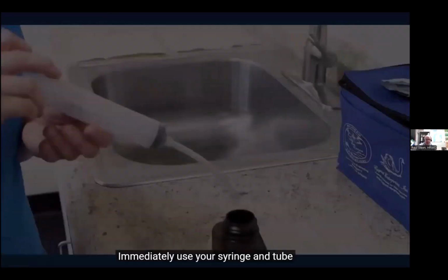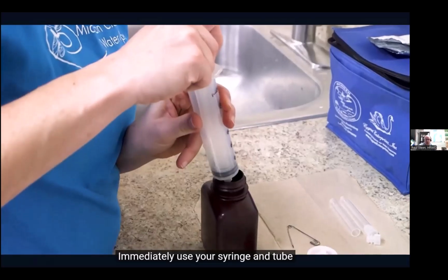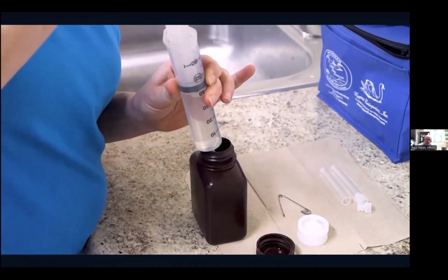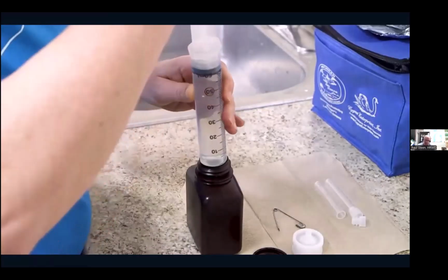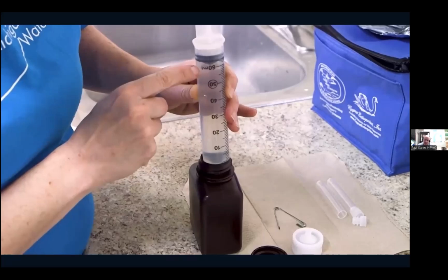Immediately use your syringe and tube to collect another sample from the bottle. You will need to reach the 60 milliliter line.